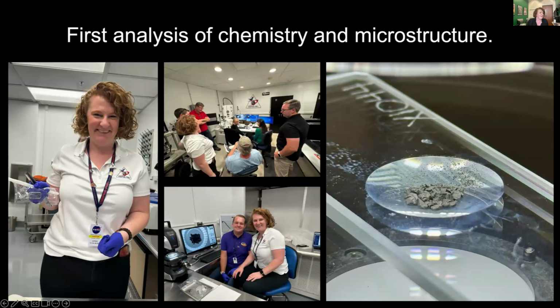So this is me looking extremely excited, holding the first vial of material from asteroid Bennu. I was the first woman that got to work on these samples, which was just the most incredible opportunity, but I was a part of this brilliant team. And here's your first look at Bennu material, just in a dimpled glass slide as we were looking at it under the optical microscope. The first thing we wanted to do was say, okay, how can we non-destructively analyze the sample to see what it looks like on the inside?